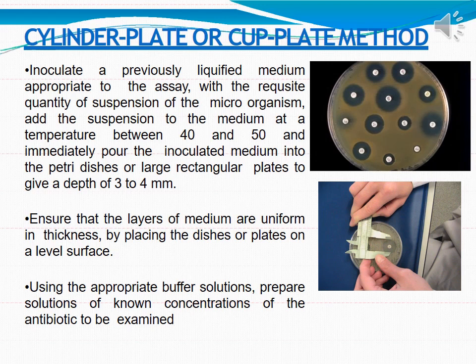And in the second hole you are going to pour the same concentration of an antibiotic whose activity you already know. So I repeat, there are two holes. In one hole you have put the antibiotic which is to be studied, and in the other hole an antibiotic of known activity. Both are used in the same concentration.